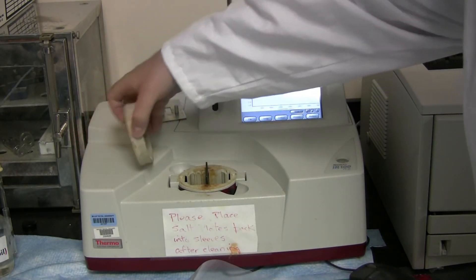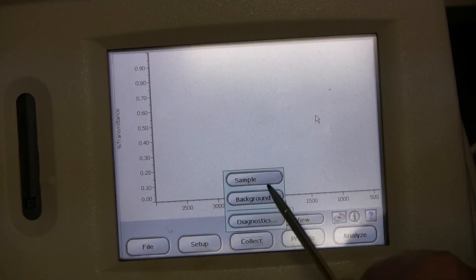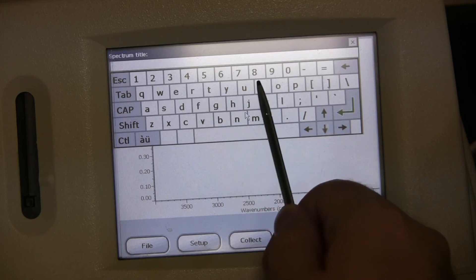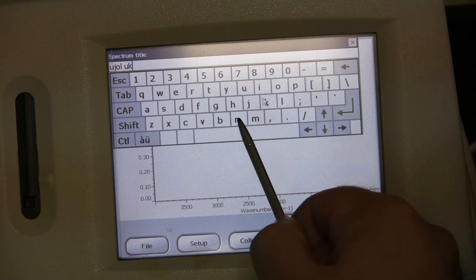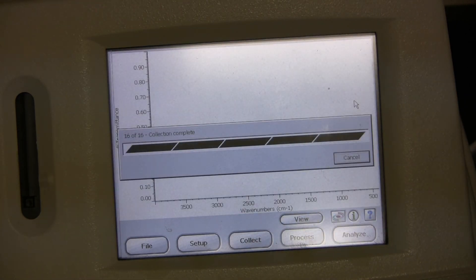Be sure to cap it. Start off by going to Collect, Sample, and then typing in something descriptive or completely random. Click OK. Again, wait for the scans to finish.